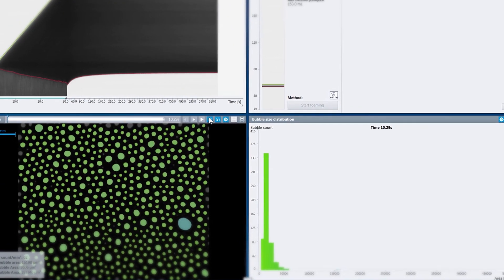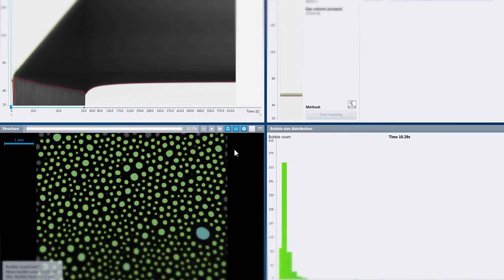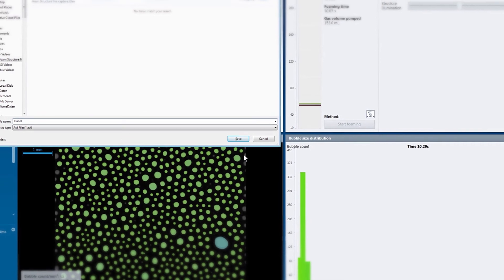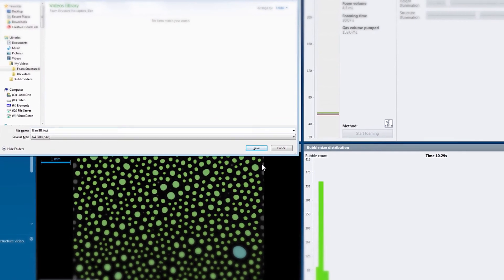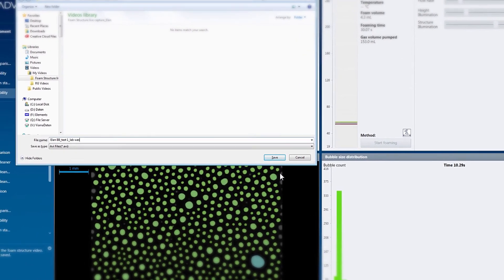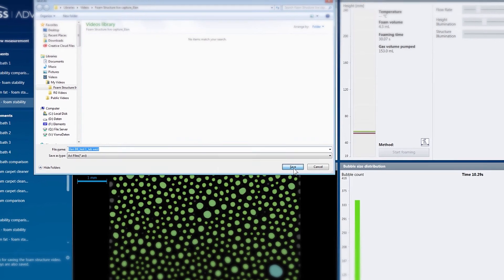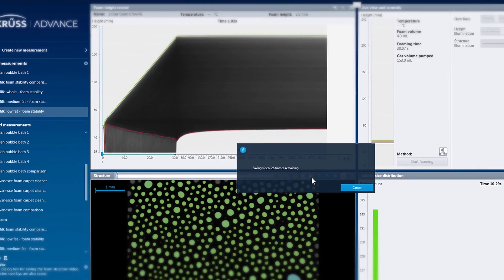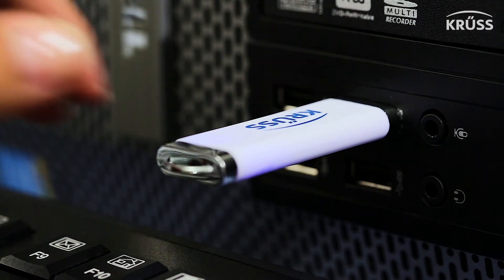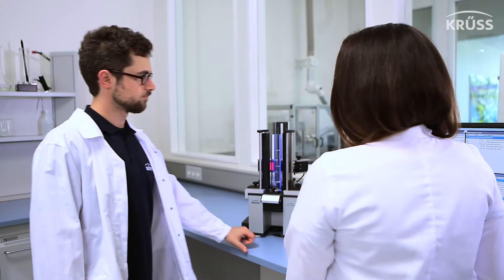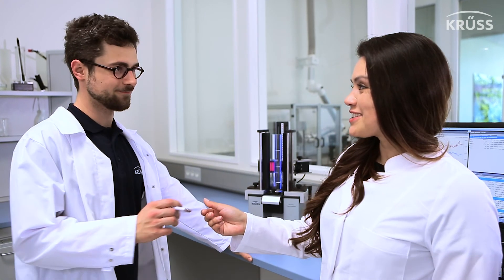The live video from the instrument's foam structure module camera is recorded in the software and can be exported with any of the three informative graphical overlays in standard video formats, or as an individual still image for each video frame. Now the exported videos can be easily archived or shared with colleagues.